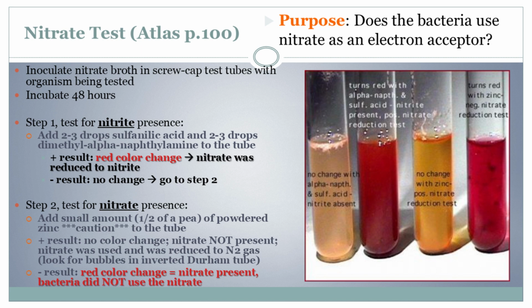This is incredible. But hold on, what happens if we add the zinc and suddenly, bam, we get that red color change? In that case, the plot thickens. A twist. A red color change after adding the zinc actually means our bacteria are off the hook for nitrate reduction. Wait, really? I thought red always meant nitrate reduction. Not in this case. Here, it means the zinc itself has done the reduction, revealing that the original nitrate was untouched by the bacteria. Wow, this test is full of surprises.